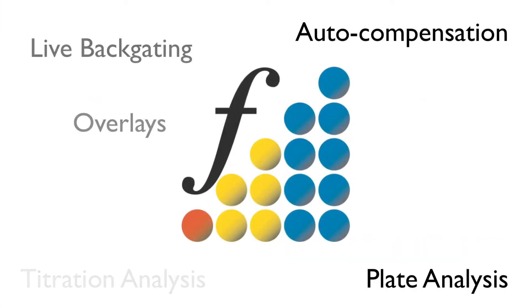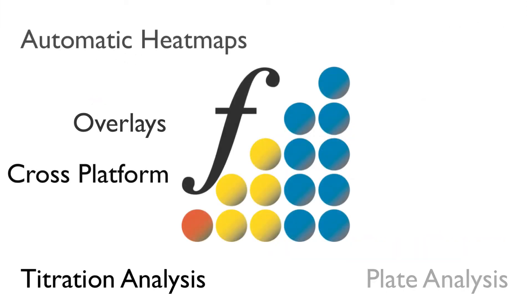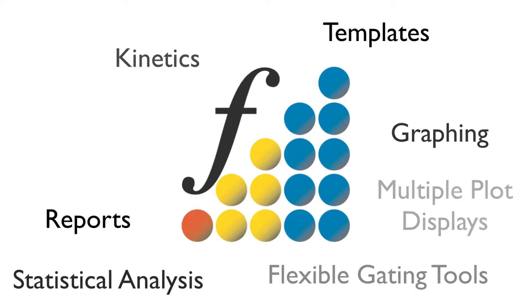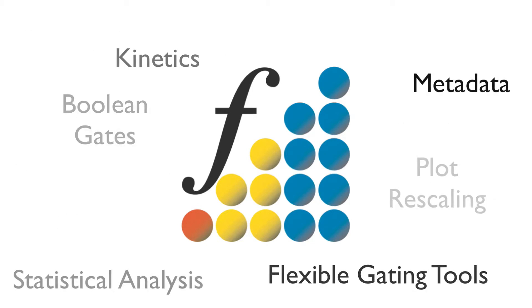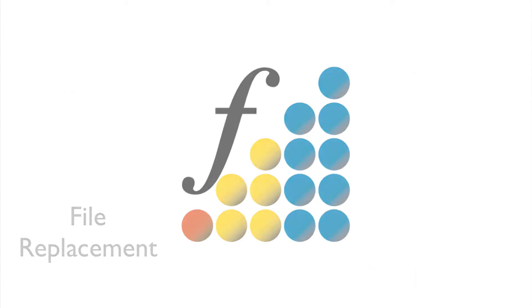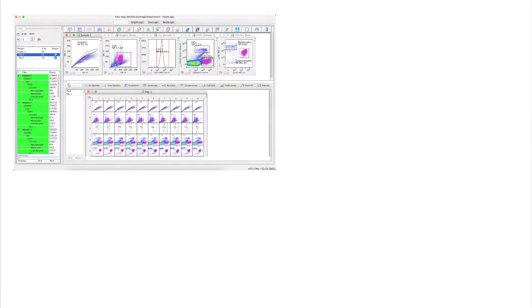FlowLogic flow cytometry analysis software is used by some of the world's leading institutes and pharmaceutical companies and offers unmatched speed and performance.